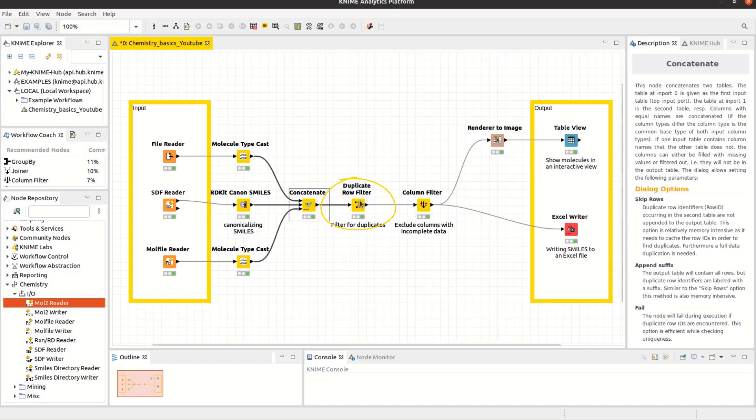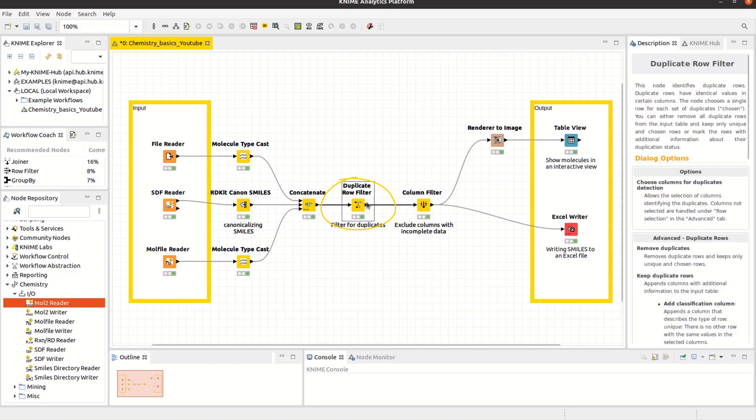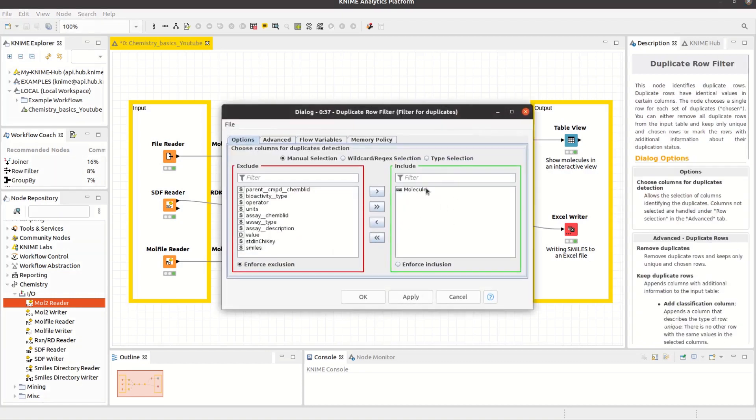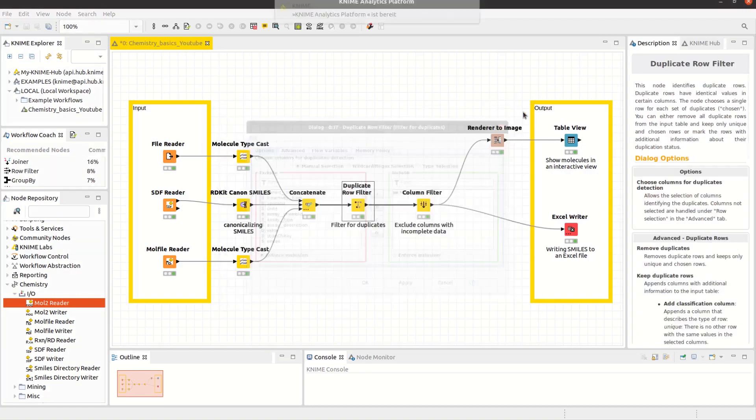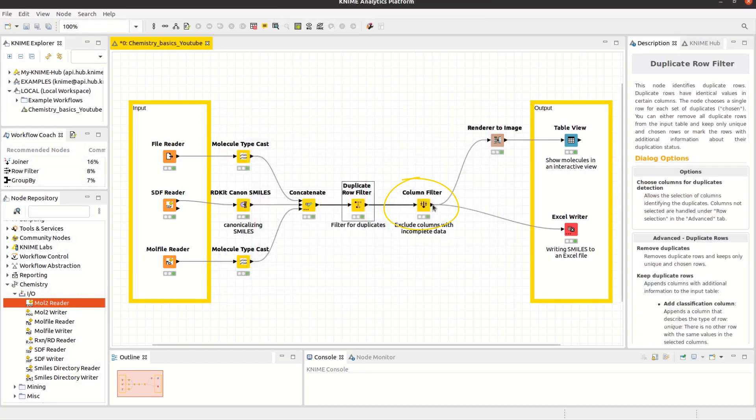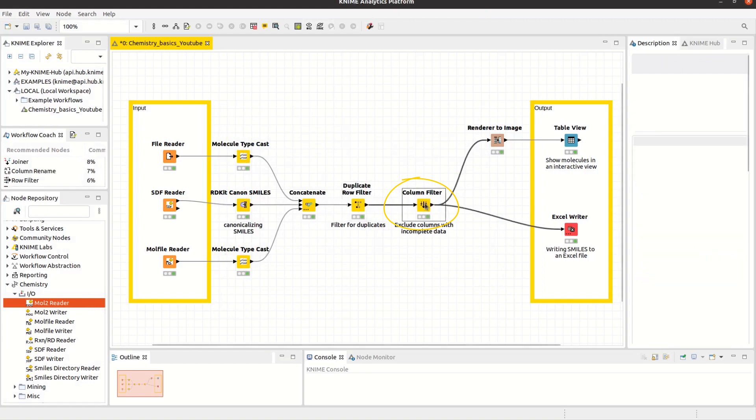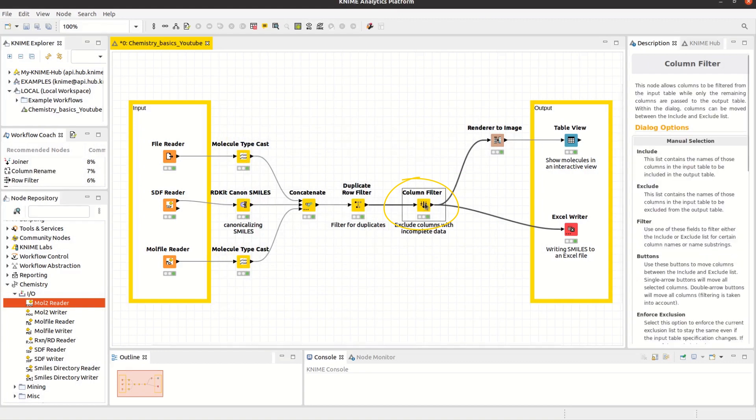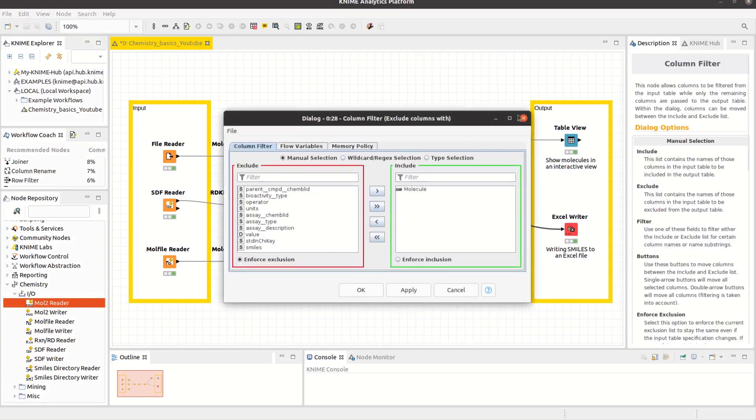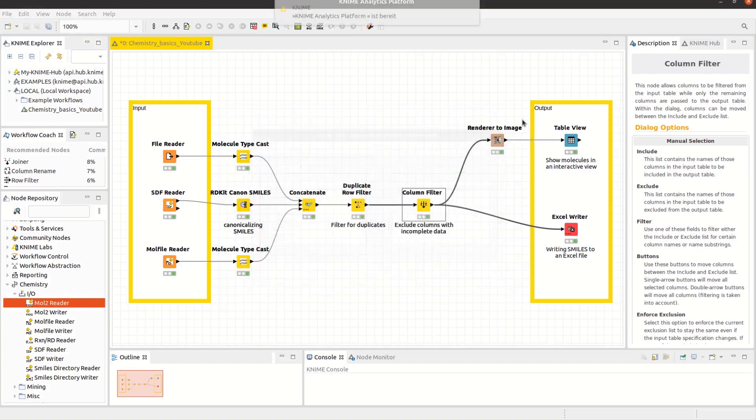To make sure that we don't have duplicate rows, we use the Duplicate Row Filter. Using the Column Filter afterwards provides us the opportunity to exclude all the columns with incomplete data or only include columns of our interest.